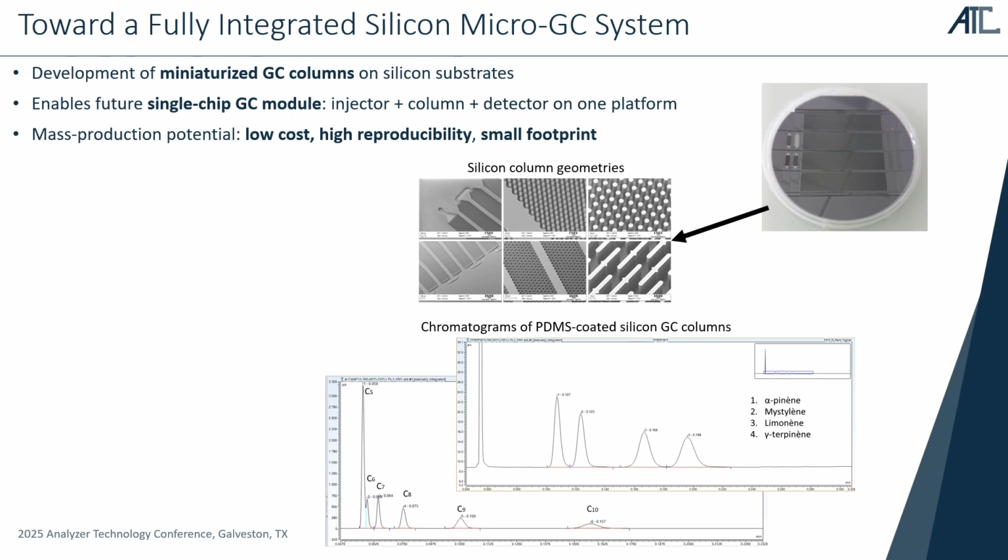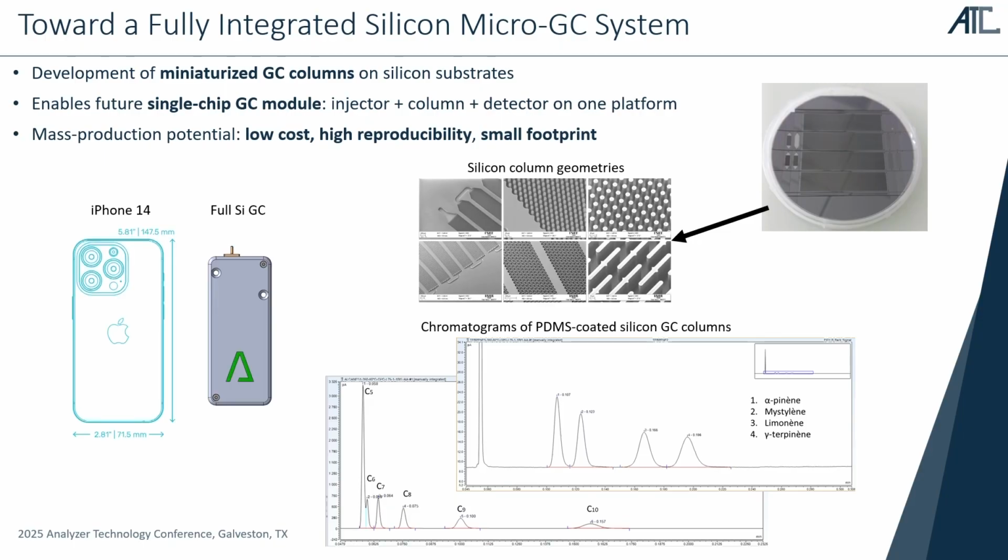And here you can see some of the early chromatograms that we obtained for, well, I probably can't read anything because I can't either, but this is VOCs and hydrocarbons separated in less than 10 seconds. So of course with a high pressure. And the speed isn't the highlight of that.